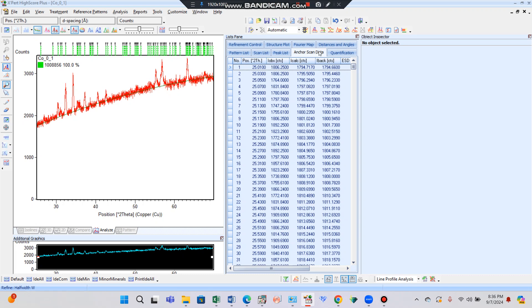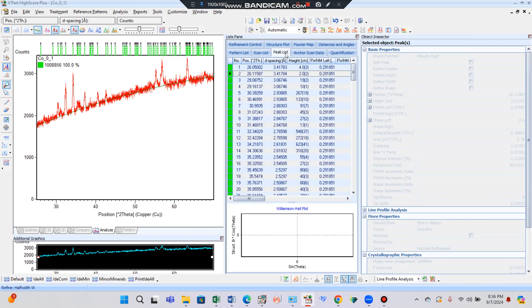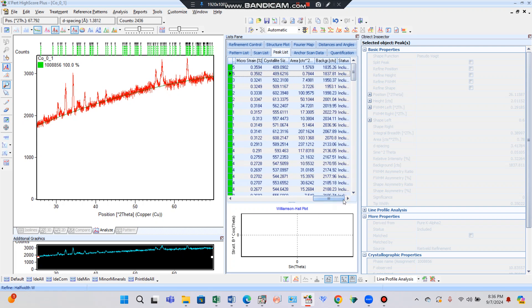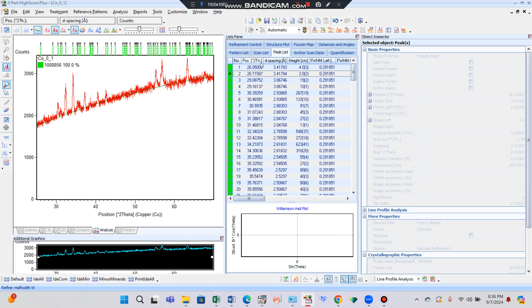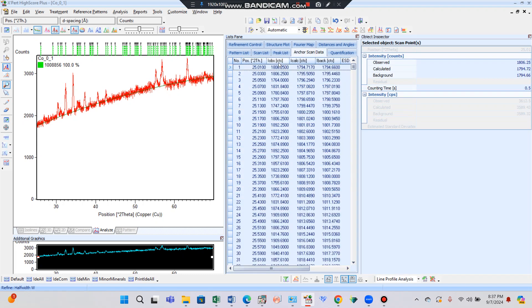This is the observed scan data. You can see the peak list — all peaks have their particular position, d-spacing, height, full width at half maximum, and other parameters. By clicking the right arrow you can see micro-strain, crystallite size, area, and other parameters. For Rietveld refinement we need position, d-spacing, height, and full width at half maximum.